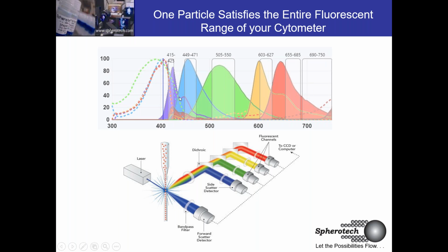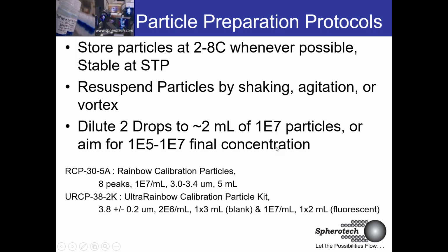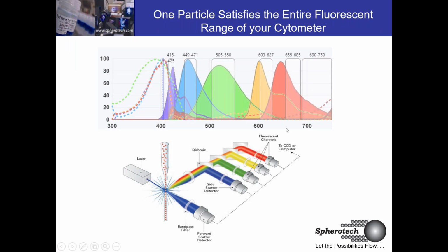And given these different bandpass filters, you'll be able to capture different data for each one. However, with these rainbows, of course, as many of you know, it works in all channels. So we're able to calibrate across all of these channels simultaneously. We're going to get into that momentarily, and also make sure to do a check-in, to make sure your instrument's working well.